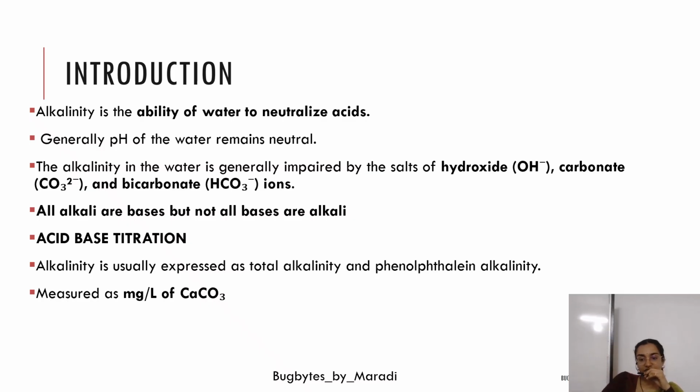Generally when we speak about water, pH remains neutral, but the alkalinity of the water is generally imparted by different kinds of salts. So you will have hydroxide ions, carbonate ions, and bicarbonate ions. These are in a huge amount and they majorly cause alkalinity in the water.